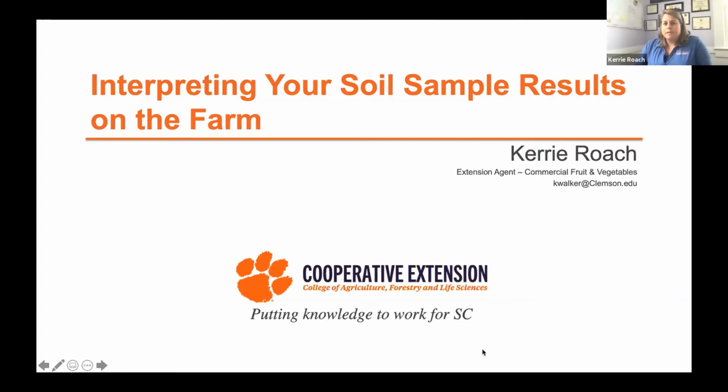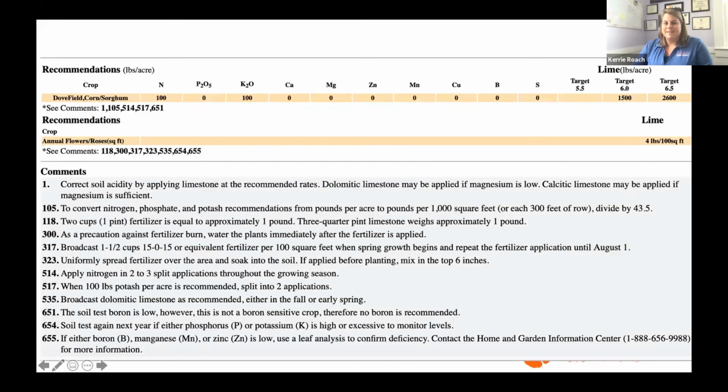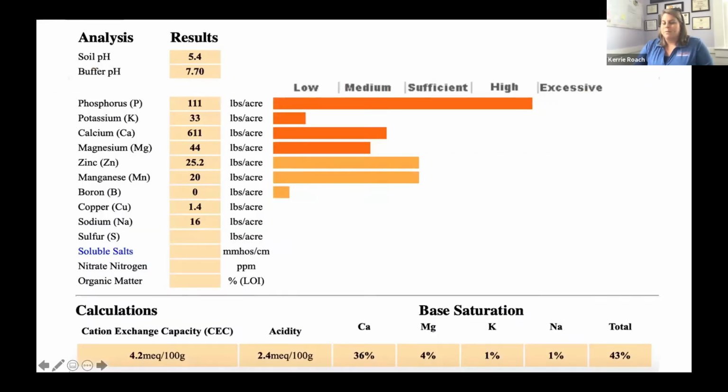So probably one of the most frequently asked questions that I get is, how do I interpret a soil sample report? People get their soil sample report back and they see this or this, and they get a little bit overwhelmed. And so one of the first things that I talk with people about is taking out a lot of the fluff.